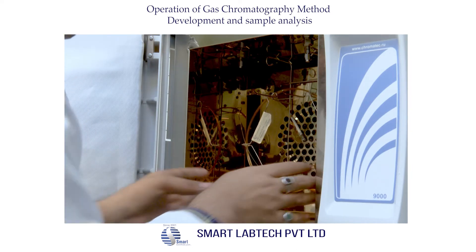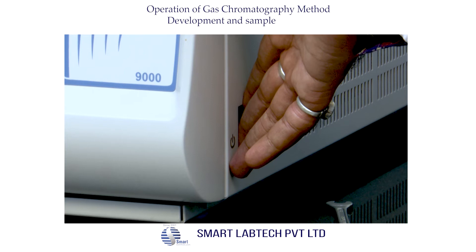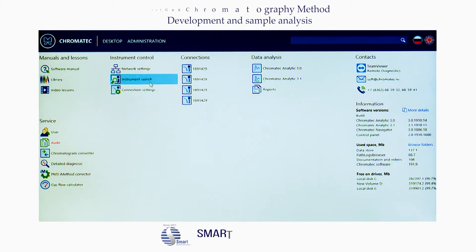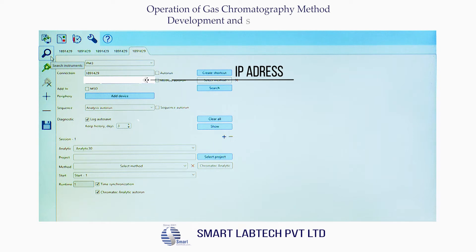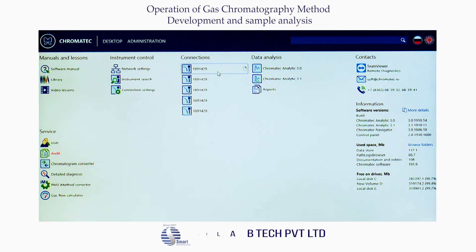Now the column is fixed and the column oven door is being closed. Switch on the gas controllers, inlet pressure gases, and then switch on the main instrument and PC. After switching on the instrument, a beep sound will come. Double-click on the Chromatic Navigator, click on instrument search, and the IP address of the instrument will be displayed. Click the tick mark to connect. Then automatically the control panel will open. Feed the IP address against connection and select Analytic 30 against the analytic under Session 1, then press Save.